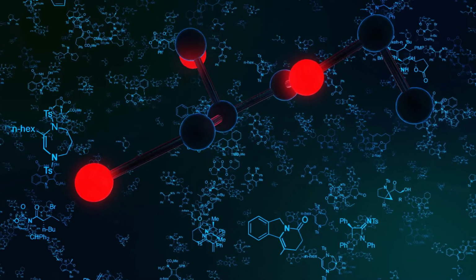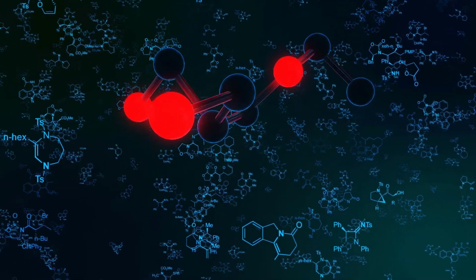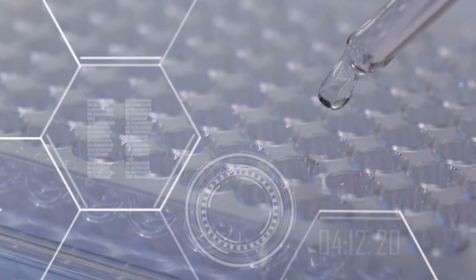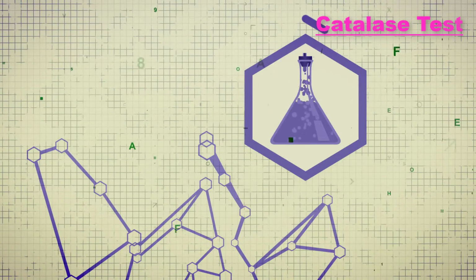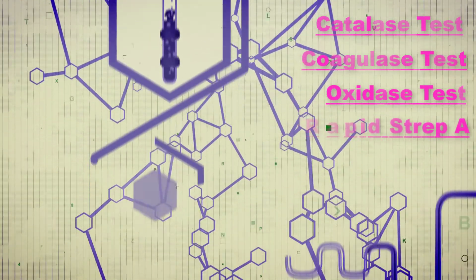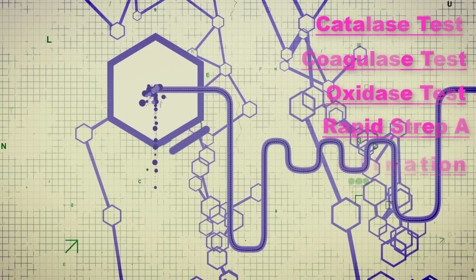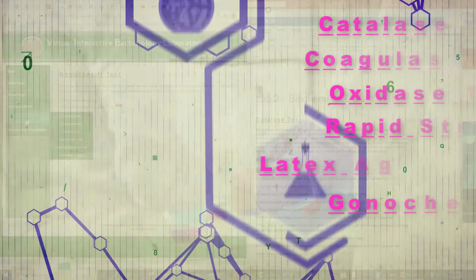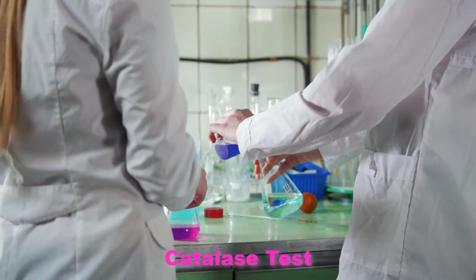Welcome to the Biochemical Virtual Laboratory for Microbiology. Today we are going to perform several biochemical tests: the Catalase Test, Coagulase Test, Oxidase Test, Rapid Strep A Test, Latex Agglutination Test, and Check 2 tests. We're going to start with the Catalase Test.